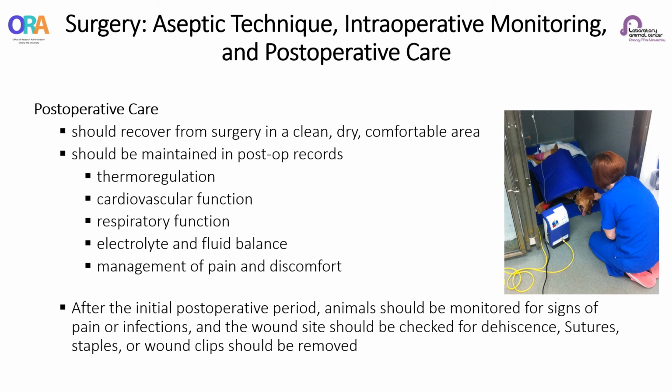In the post-operative period, particular attention should be paid to thermal regulation, cardiovascular function, respiratory function, electrolyte and fluid balance, and management of pain and discomfort. After the initial post-operative period, animals should be monitored for signs of pain or infection, and the wound site should be checked for detection of separation of the wound. Sutures, staples, or wound clips should be removed after an appropriate amount of time.